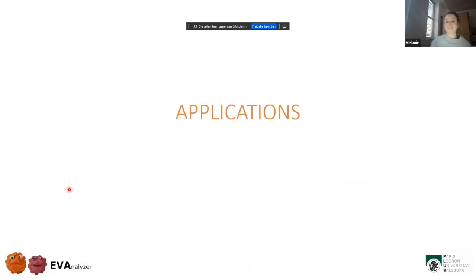Next, I want to give you some application examples for the EVAnalyzer. We are using it really on a daily basis, and there are a lot of application examples in the manuscript. I will only give you some examples because it would take too much time to get into each example that we have given.